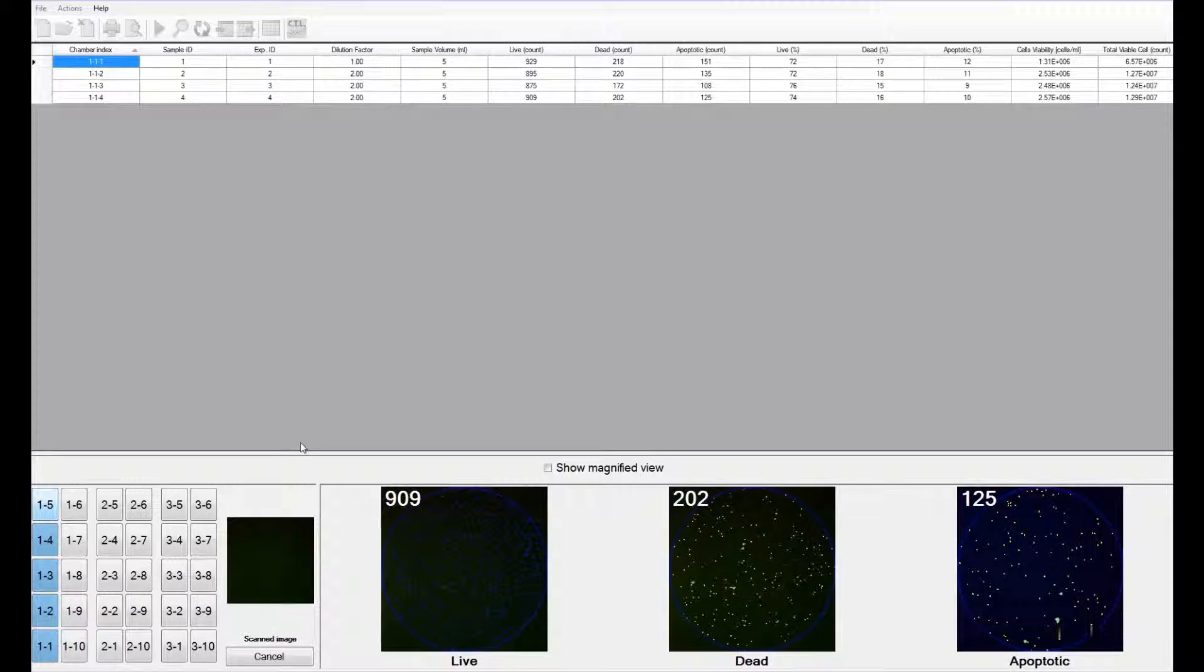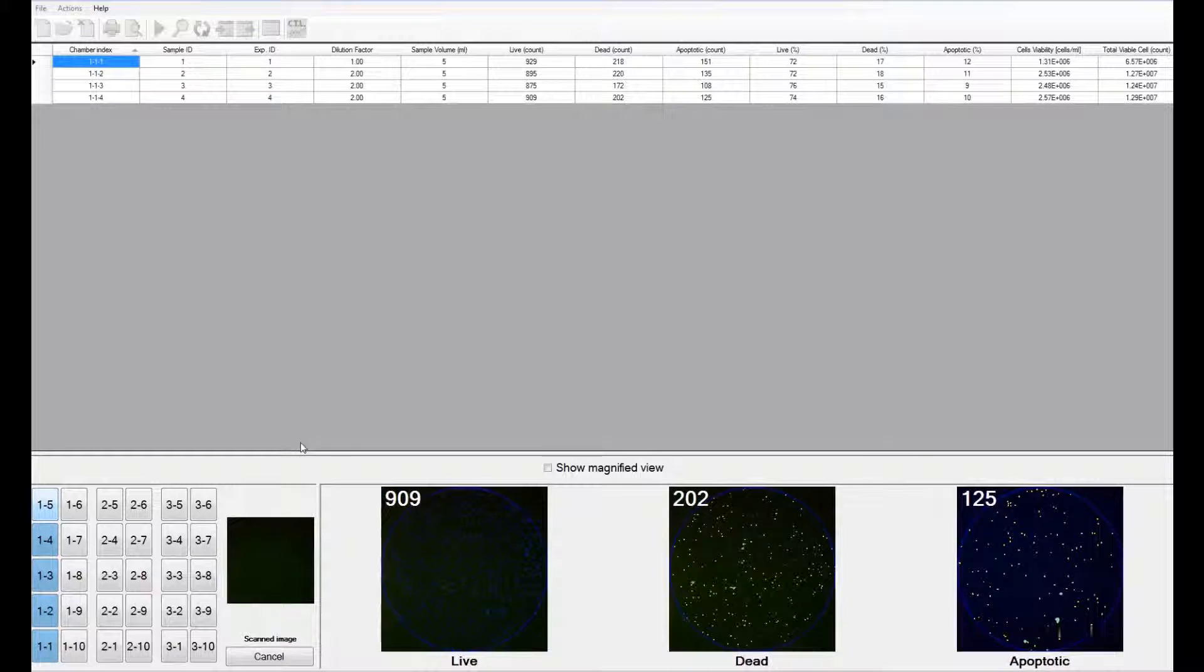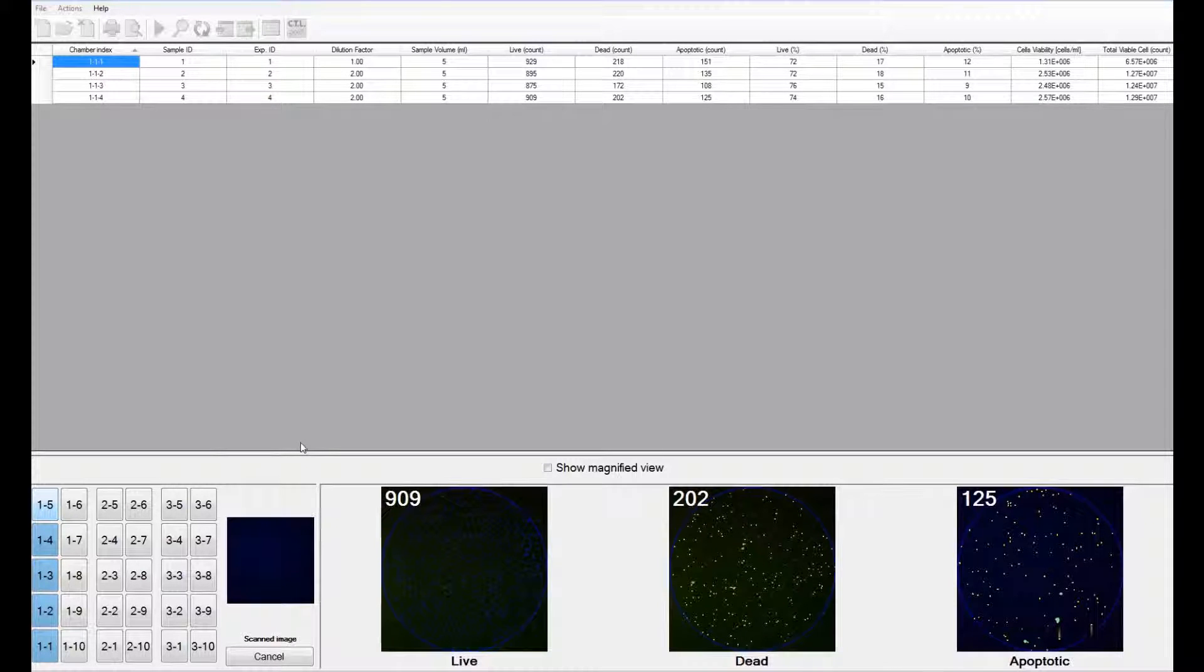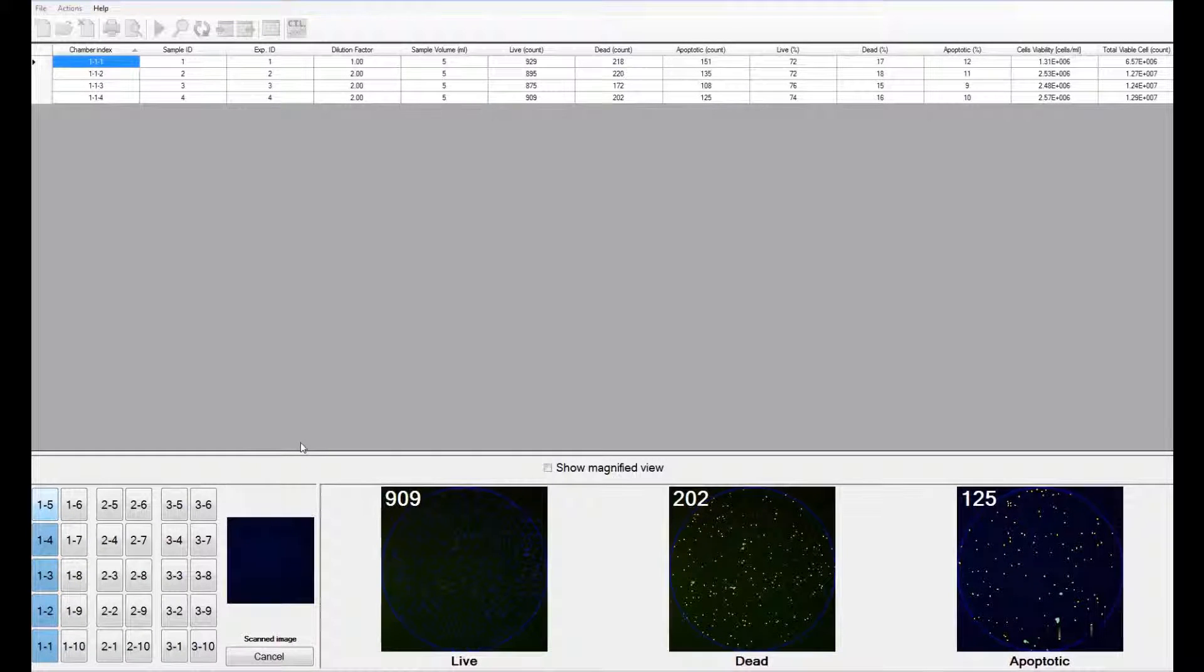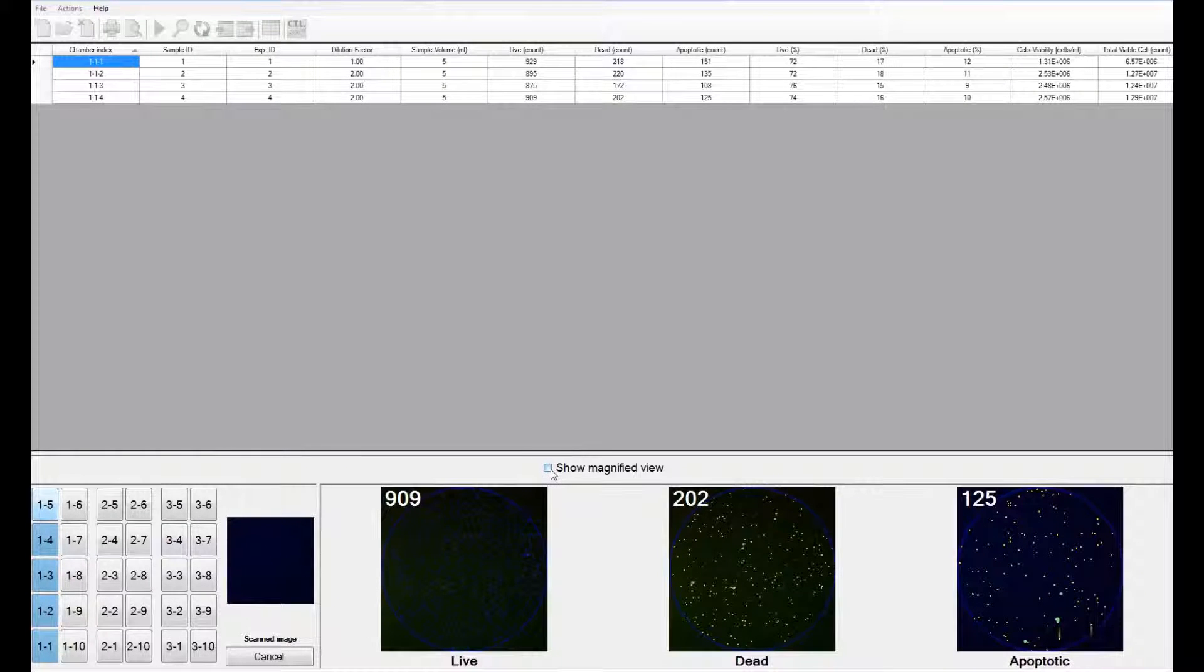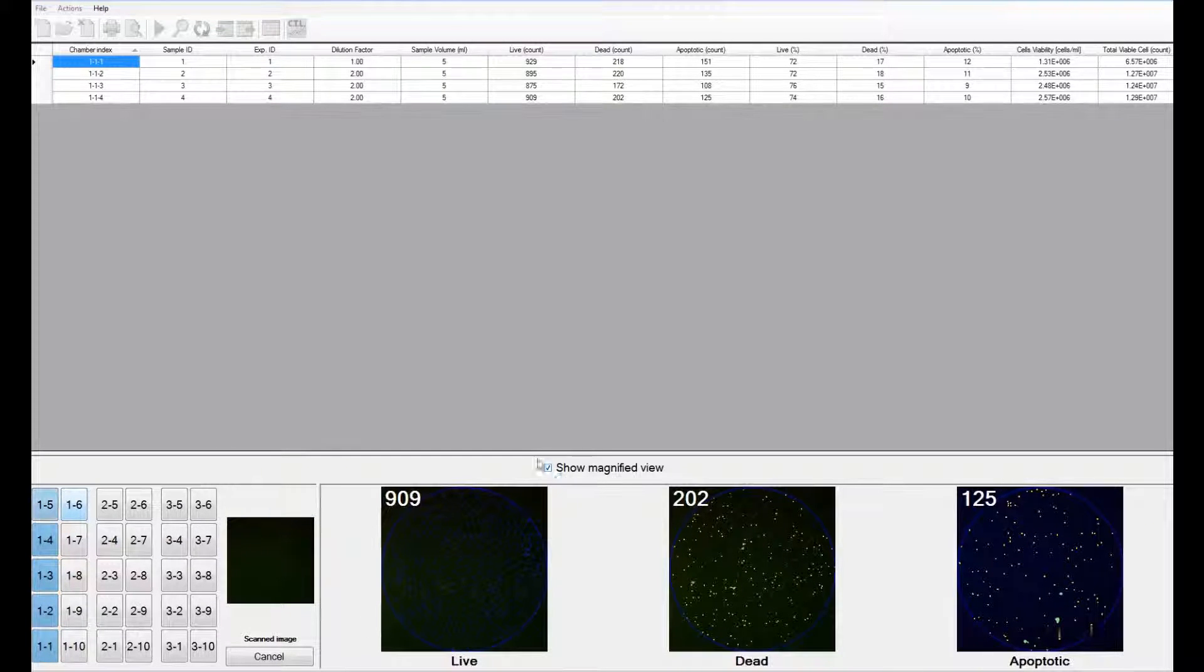If a cell is positive for both the live and apoptotic stains, it is considered apoptotic. If a cell is positive for both the dead and apoptotic stains, it is considered dead. On clicking on the show magnified view icon, you can view samples as it is being counted.